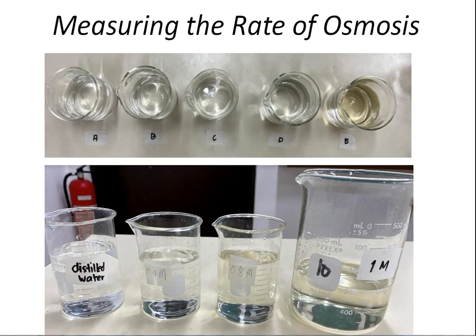We are now done demonstrating our activities regarding rate of diffusion. Let's now look at the factors that can affect the rate of osmosis. For our first activity, the rate of osmosis will be investigated using artificial semi-permeable membranes. So our ever-dependable cellulose sac. The cellulose membrane is also known as dialysis tubing, as we have explained before.